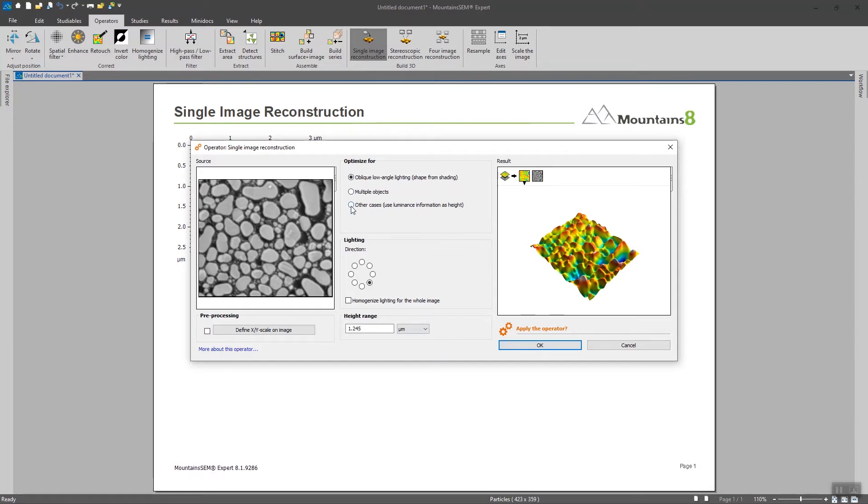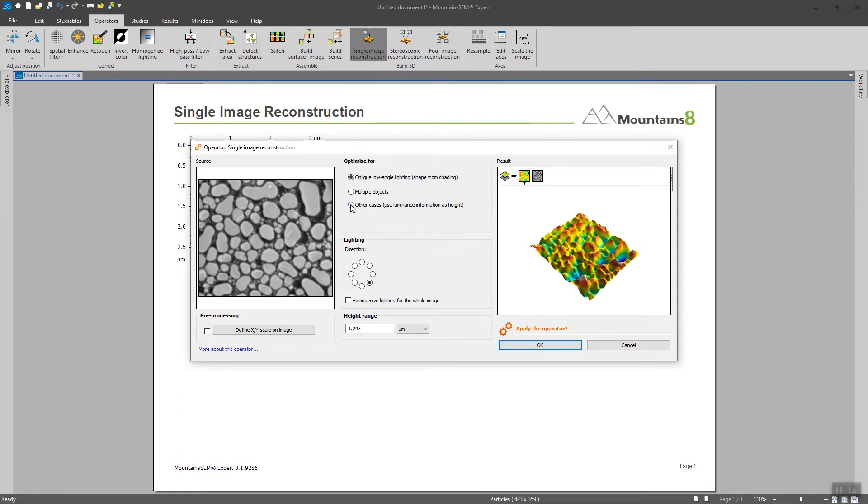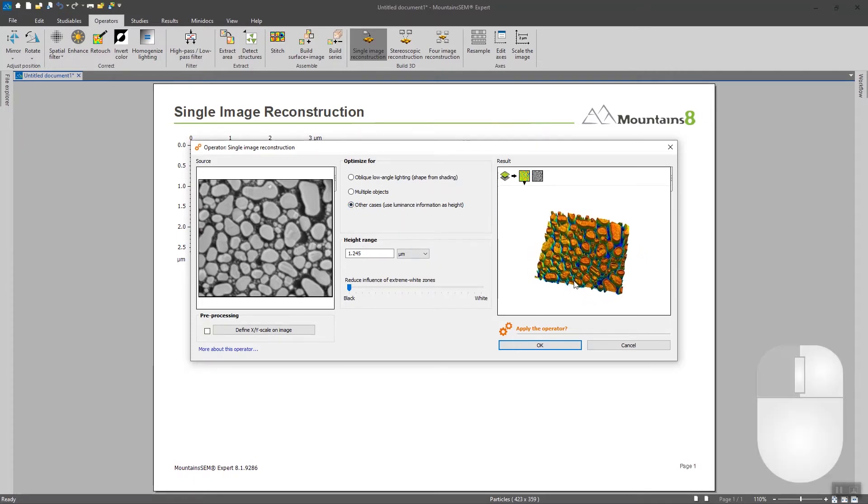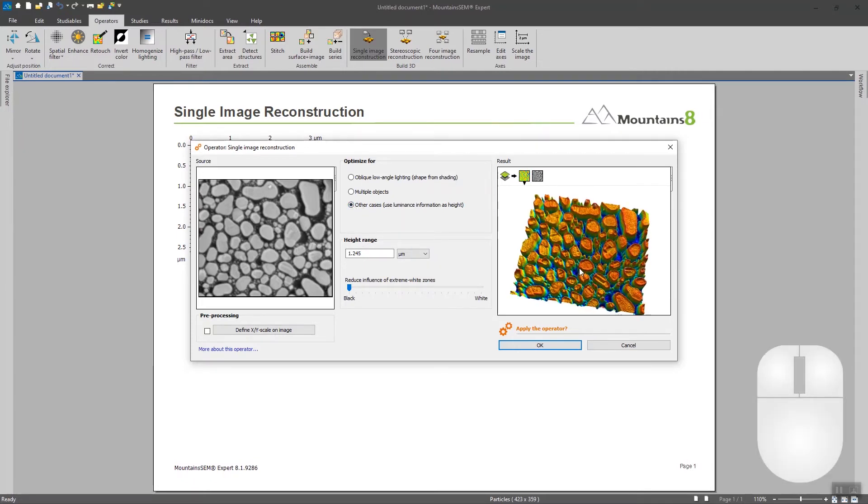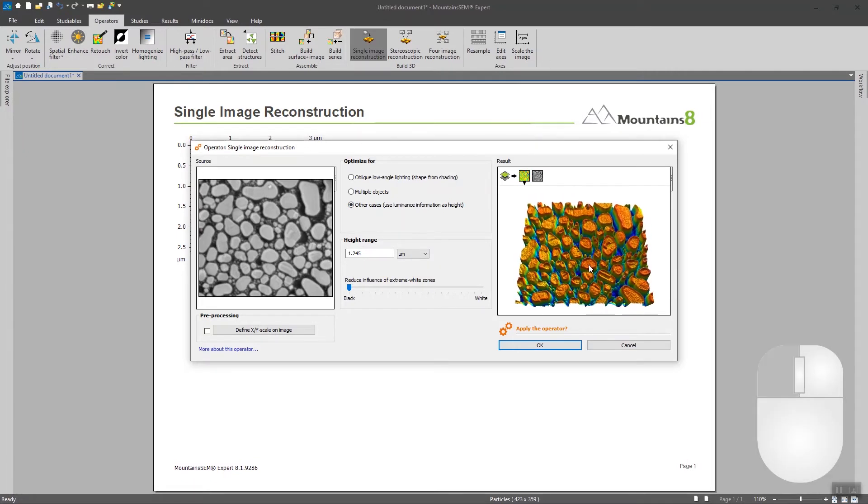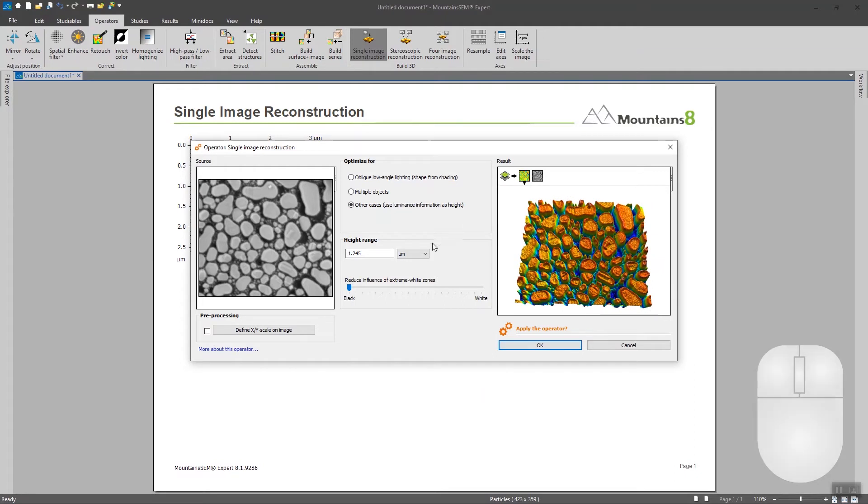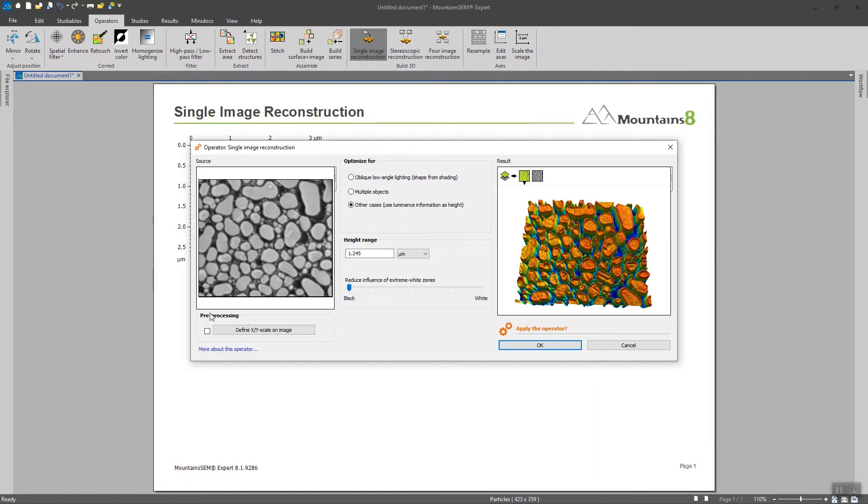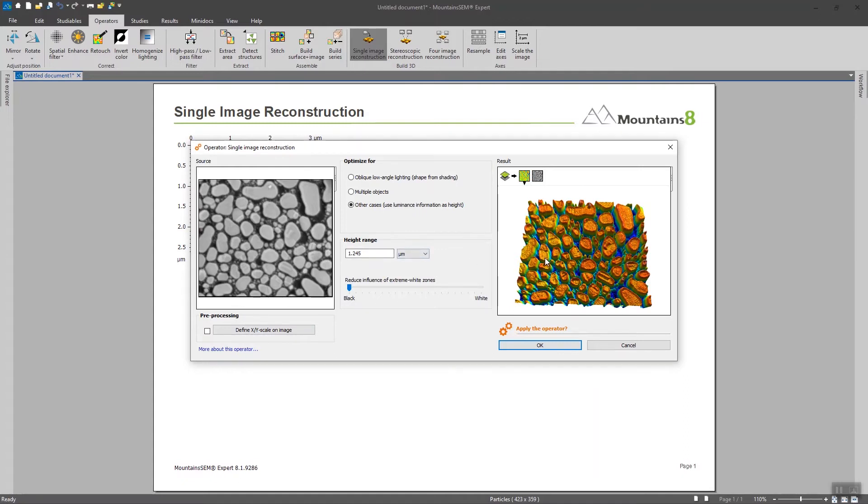So here we are going to tick use luminance as information and we can see that the rendering that we have on the right is pretty nice. In fact the software is going to consider that dark areas are going to be deep on the image and that whiter elements are going to be higher on the image. So here we have the perfect example to use this kind of technique since we have a very dark background and brighter elements.